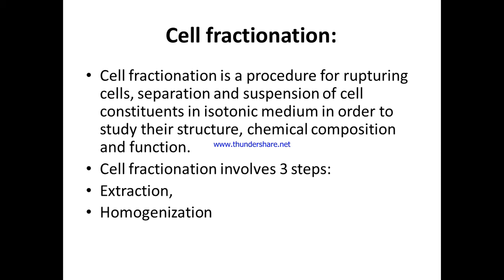The first one is the extraction, the second one is homogenization, and the third one is centrifugation. So let's talk about each step of the cell fractionation in detail. The first step is extraction. Extraction is the first step toward isolating any subcellular structure.